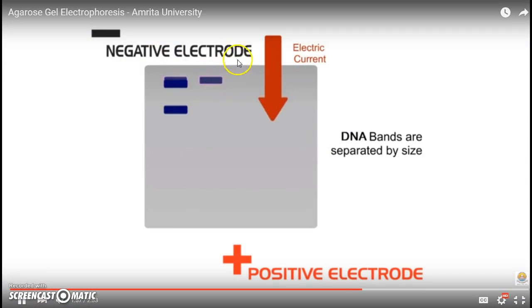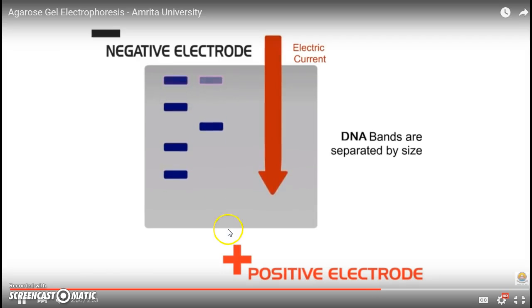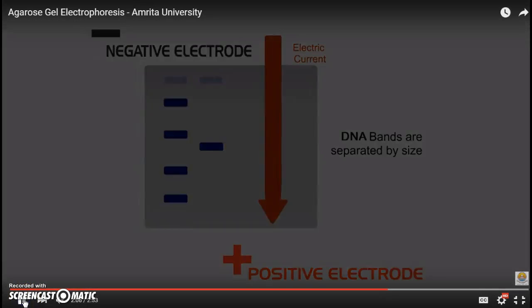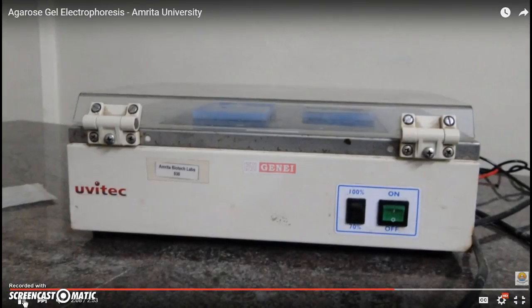But basically, remember, DNA is negatively charged, so it goes away from the negative electrode and towards the positive. And you can see here as it moves, the smaller pieces are going to move further than the larger pieces. So the DNA bands are separated by size, and we can see where the restriction enzymes cut our DNA. Okay, so let's just see what it looks like, just so you can visualize.